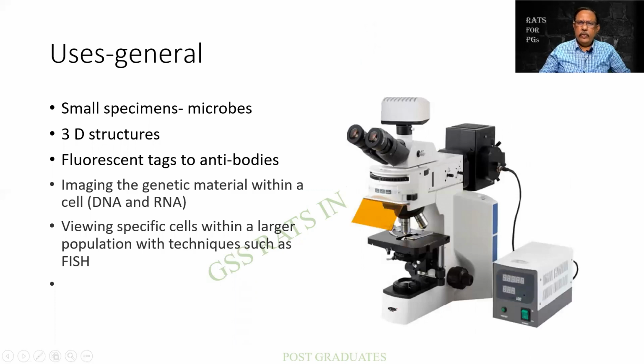Look at this instrument over here. This bears all the description that I had been mentioning. Now, what are the general uses? General uses is not the application, but then we should have a beginning somewhere. It can be used to view small organisms or microbes. Also, three-dimensional clusters such as papillae or a three-dimensional cell or a tissue appearance.